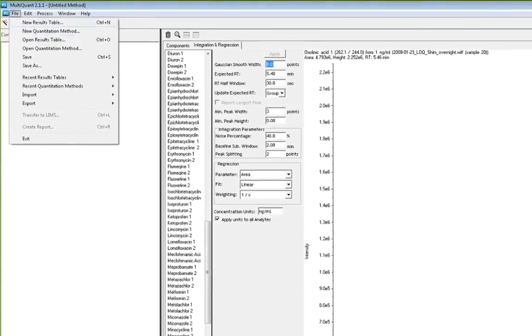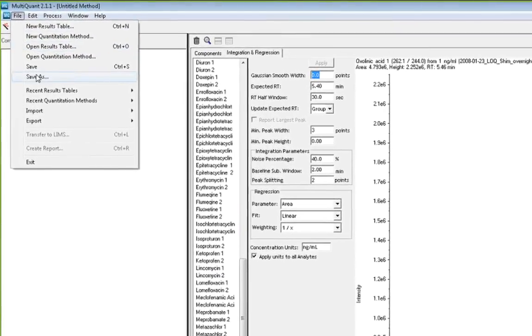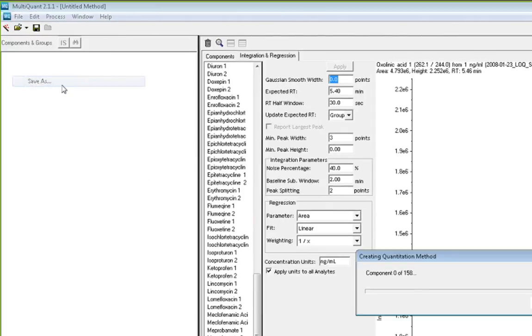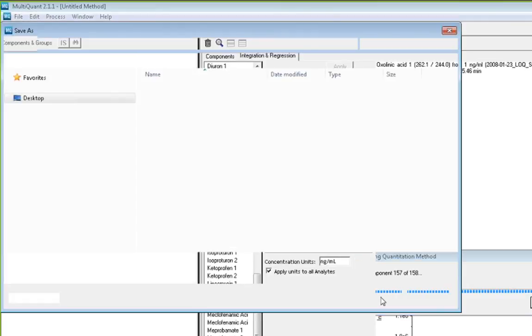Once you've reviewed all of the integration parameters, select File, Save As, and save the quantitation method, and you're ready to start quantitation for your datasets.